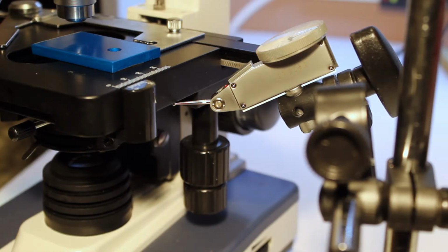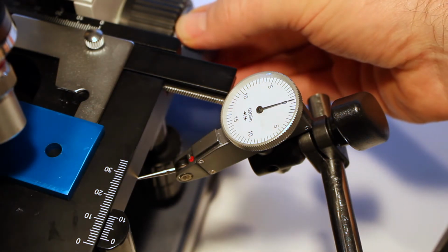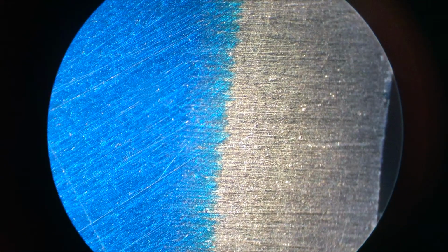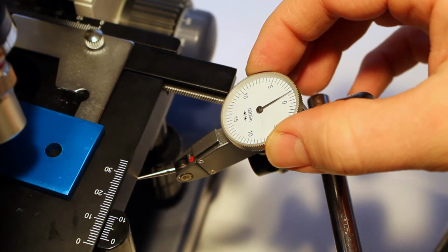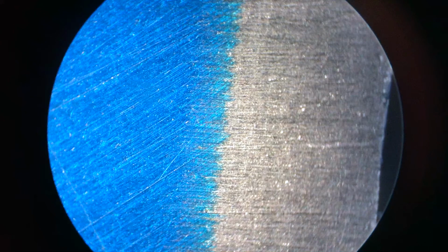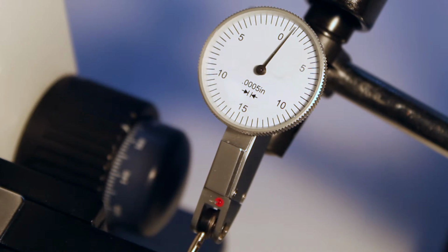The sample is under the lens, magnifying it 100 times, and the indicator is on the mechanical stage. I adjust the fine focus to find the very bottom of the anodized layer. I zero out the dial of the indicator, and then I adjust the fine focus to find the very top of the anodized surface. Then it was just a matter of reading the dial indicator. On this piece it looks like about 7/10,000ths of an inch.